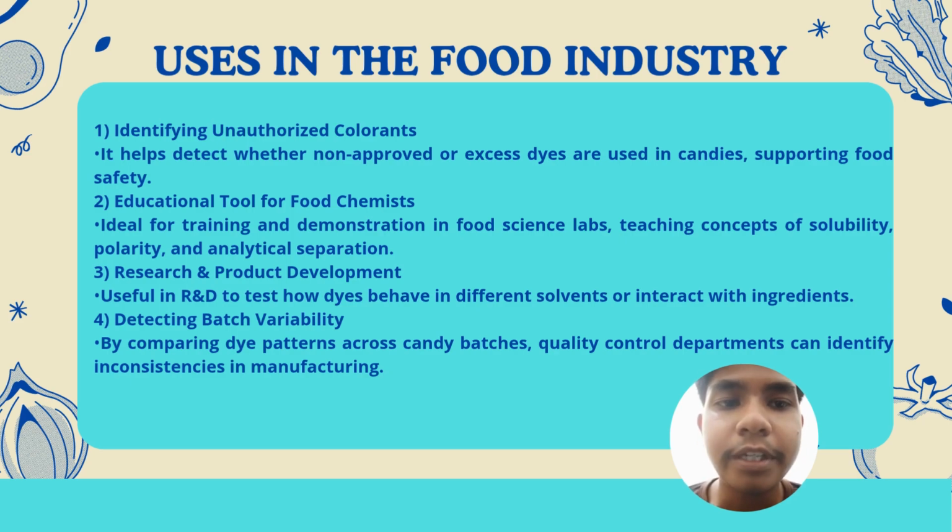Second, educational tool for food chemists. Ideal for training and demonstration in food science labs, teaching concepts of solubility, polarity, and analytical separation. Third, research and product development. Useful in R&D to test how dyes behave in different solvents or interact with ingredients. Fourth, detecting batch variability. By comparing dye patterns across candy batches, quality control departments can identify inconsistencies in manufacturing.